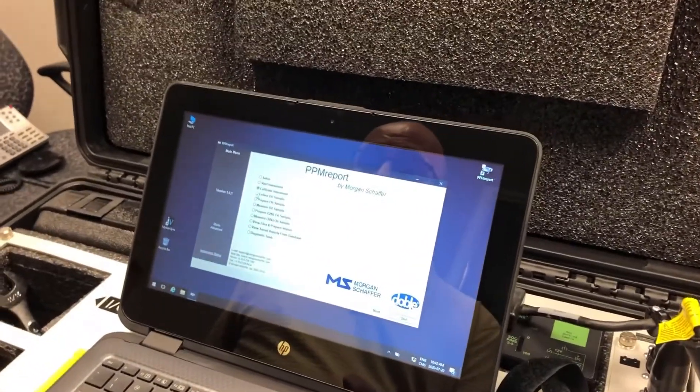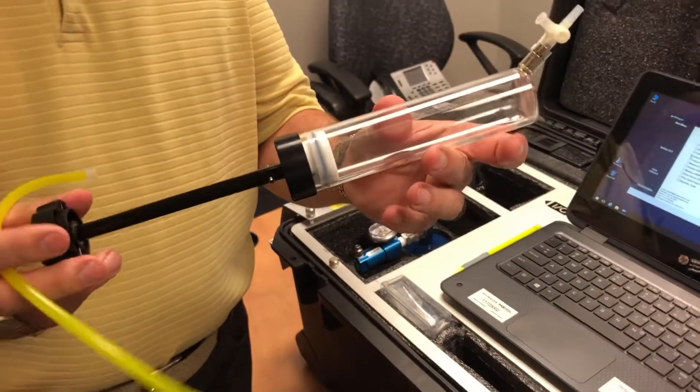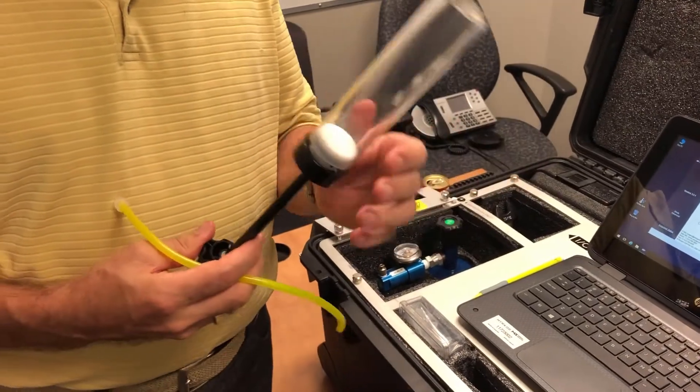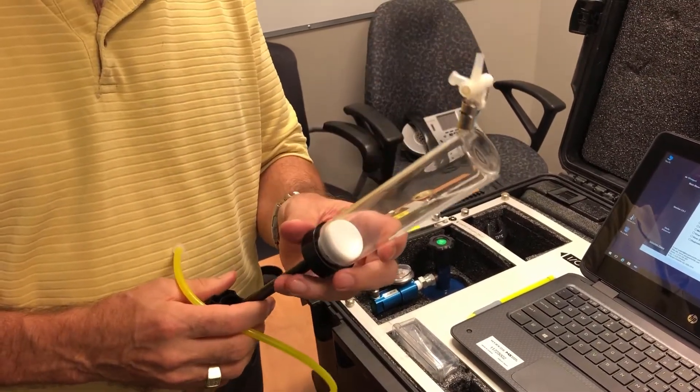Okay, so the next step now is how to collect the oil sample. So this is the shake test syringe that comes with the Myrkos. It's specially designed for Morgan Schaffer.